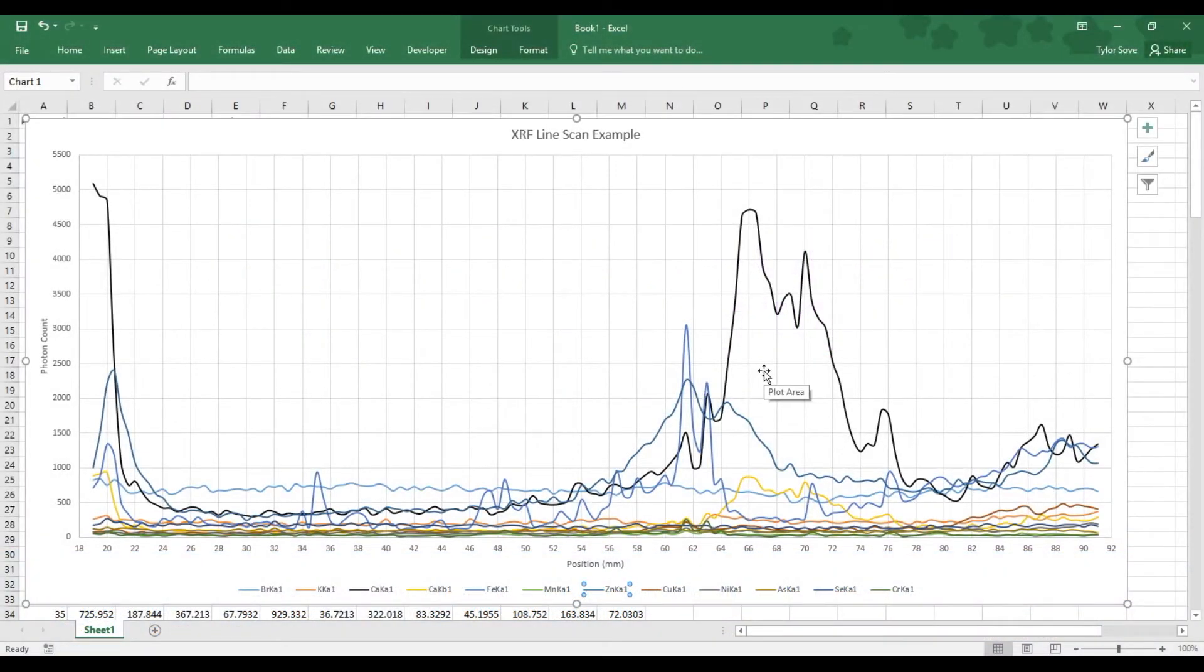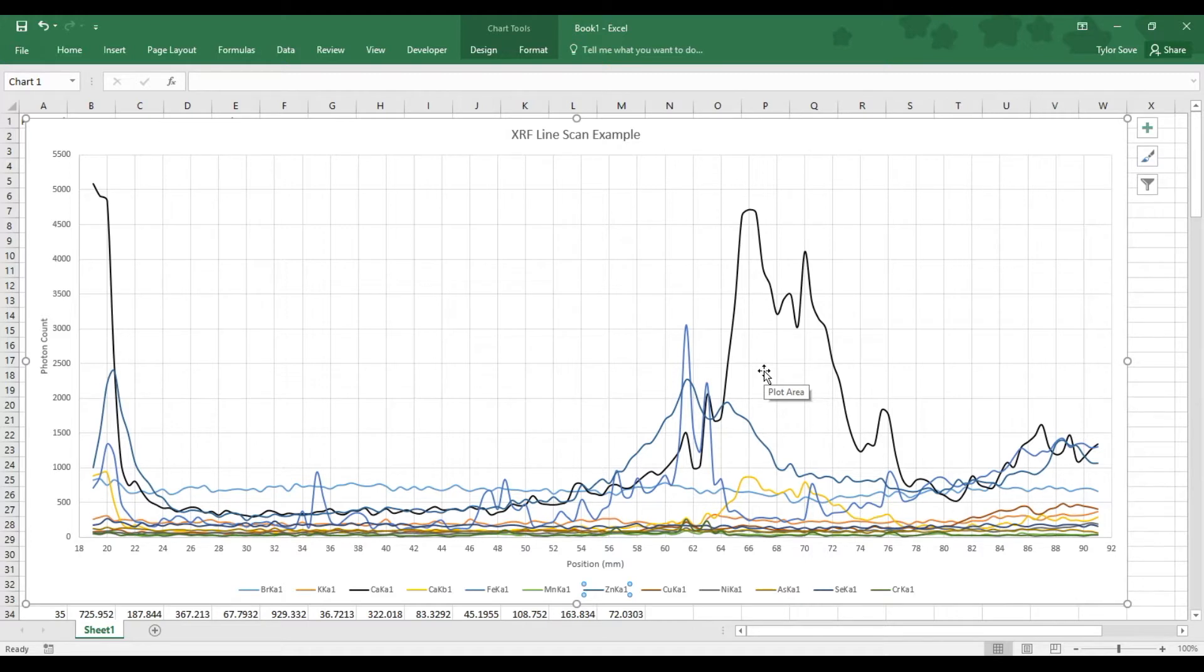Now that we have an XRF line scan in front of us, we can start going through this and identifying different features and how to understand those. We'll start by understanding the color coding and the legend.